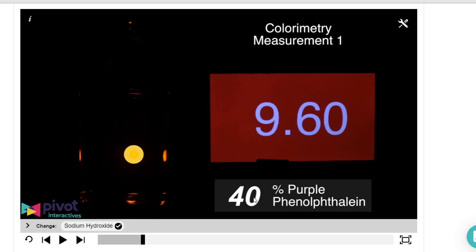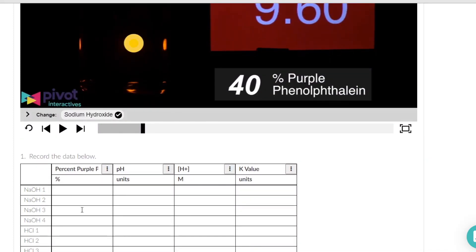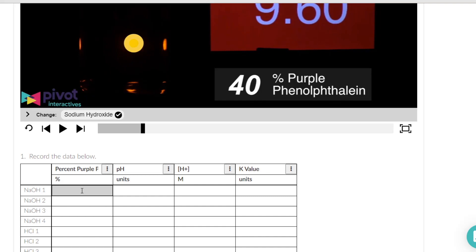So you can calculate the concentration of the purple phenolphthalein. You can calculate the concentration of the clear phenolphthalein. And given the pH, you can also calculate the hydrogen ion. Once you collect that data, you can come in here and you can pick, here's my sodium hydroxide one. Because when they add some, you get one pH and one purple phenolphthalein. You'll enter those numbers here.